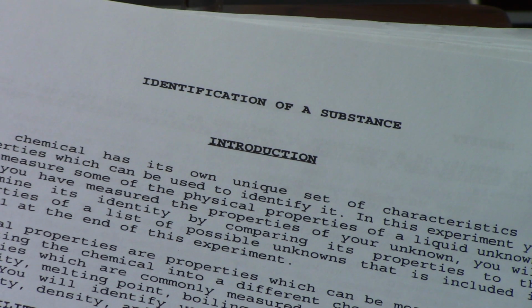What you need to do, as I go through this, is record what I ask you to record. So the first thing I'm going to ask you to record is if the unknown is soluble in the particular liquid. The second thing is I'm going to be weighing a substance.